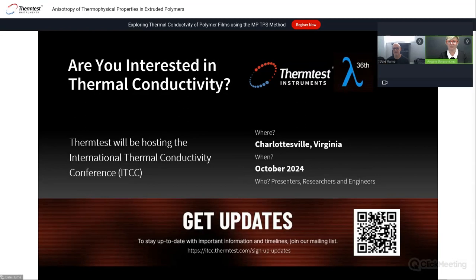the last points are really to consider anisotropy. If you're measuring bulk for everything, one more technical tip that I like leaving: if you're measuring bulk properties and the volumetric specific heat that you're calculating from your three-dimensional or bulk property doesn't line up with your direct measurement of specific heat by DSC or specific heat module, that can be a sign of anisotropy. So that might be good to investigate further.